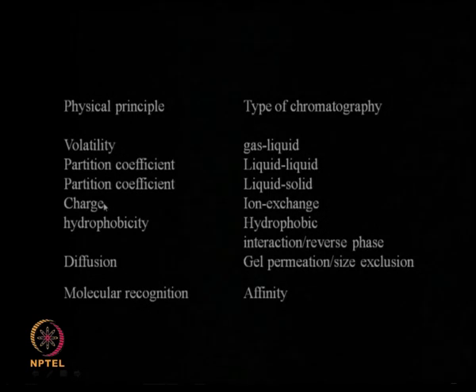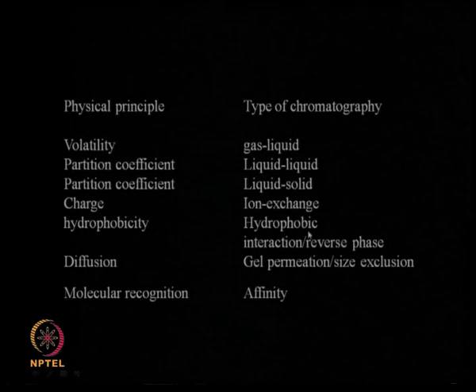If the separation is based on charge, that means positive charge or negative charge, then it is based on ion exchange chromatography. If the separation is based on hydrophobicity, that means because of the hydrophobic nature of certain proteins, they get retarded inside the column, then we call it hydrophobic interaction or reverse phase chromatography.